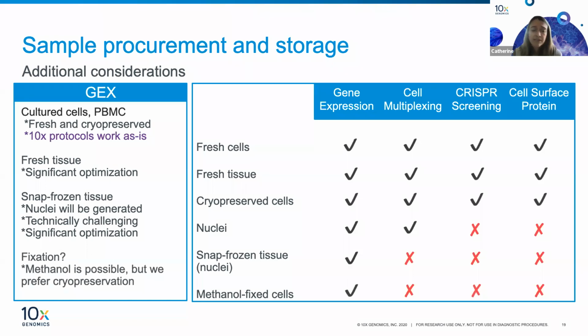We do have a fixation protocol for working with a single cell suspension. This is our methanol fixation demonstrated protocol. This is very technically challenging as well, so it does have limited capabilities with these cells. If you're looking to preserve your cells in order to process later, we would always suggest cryopreservation of your cells instead, if possible.